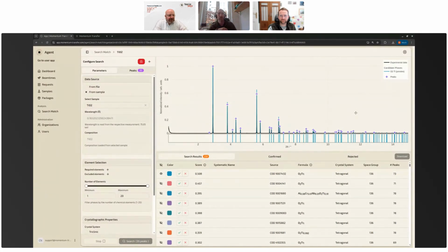So that's also something important to know, and also why, if you upload your own data, you should make sure you use the correct wavelength. Otherwise, it won't work. Okay, I think we have a couple of questions about which elements, but there is one.